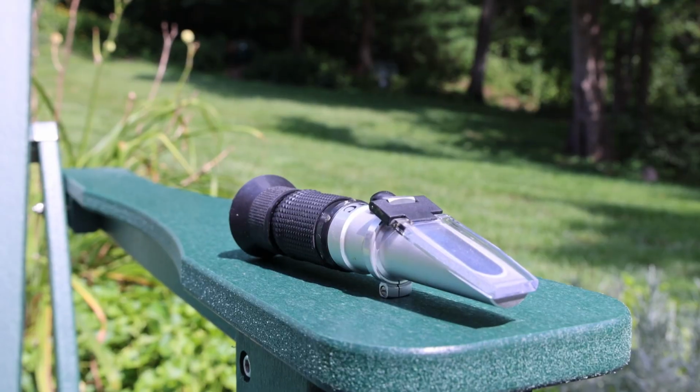It's critically important though that you use one. I'm going to go back to it again. If you are going to consume the honey, sell the honey, or give it to friends, you got to know what the percentage is, and a refractometer is the absolute best way to do it. So there you have it.